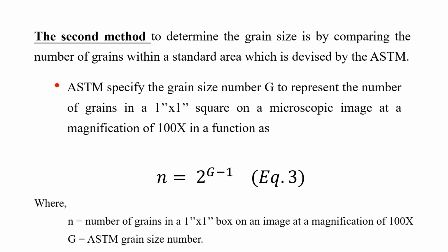There is another method to determine the grain size. It is by comparing the number of grains within a standard area, which is defined by the ASTM.